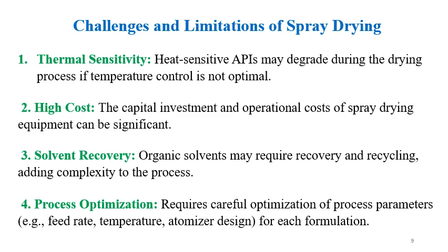Then viscosity of the input material. Many of the times nitrogen is required. Also, safety considerations are there whenever you are operating spray dryer and using the organic solvents. Atomizer design has great impact onto the powder output, mainly onto the particle size of the output powder.